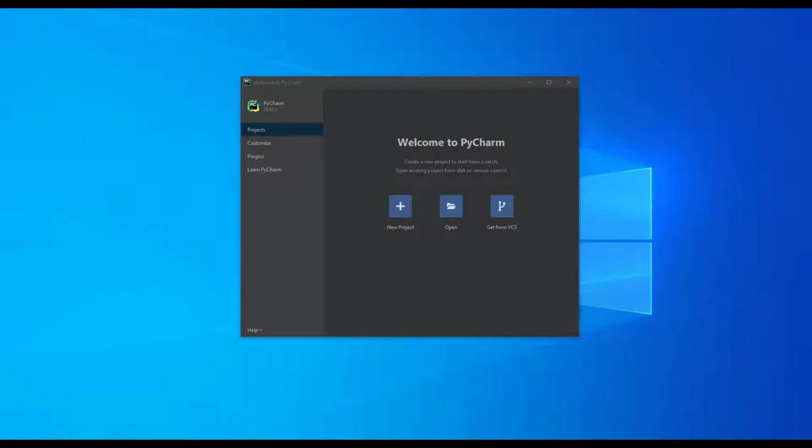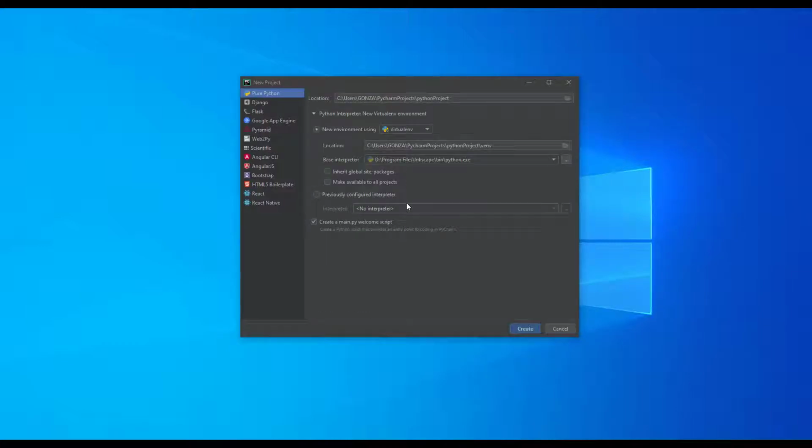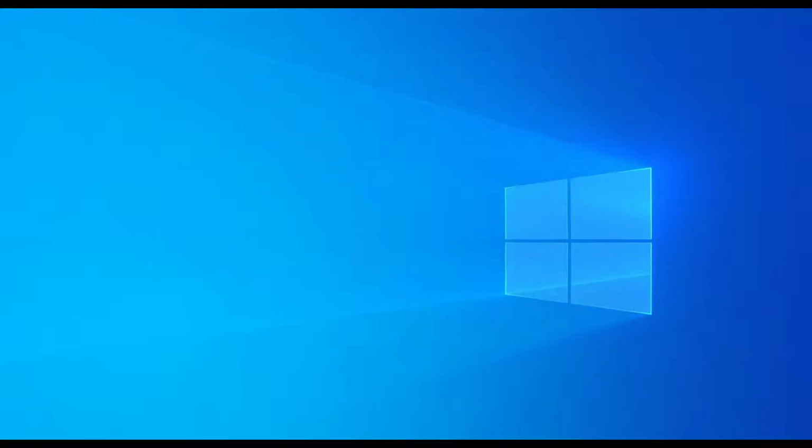Okay, so I have some other videos on how to really view these FASTA files, but I really wanted this one just to be how to get it quickly up on the screen. So if you open up, I use PyCharm, and this part already kind of requires you to have a knowledge of Python. So I'm going to make a new, I didn't pick an interpreter. Great. I'm going to have to pause this.